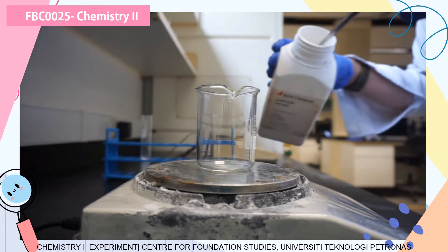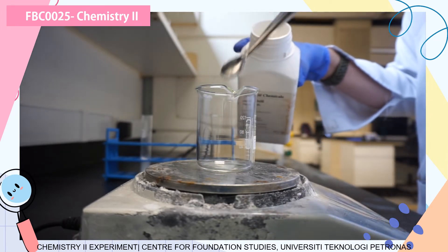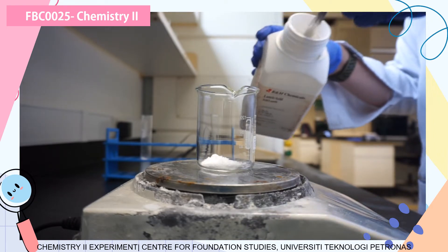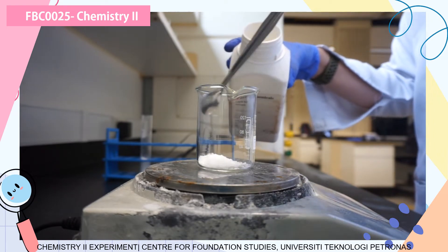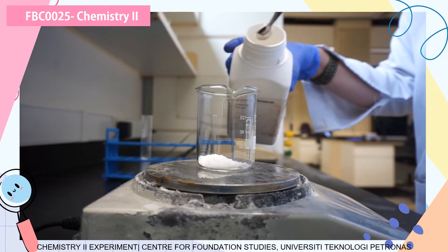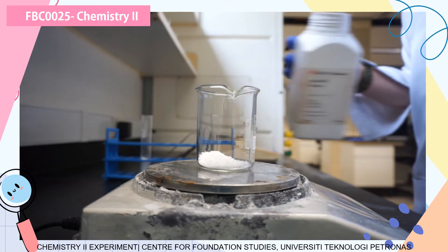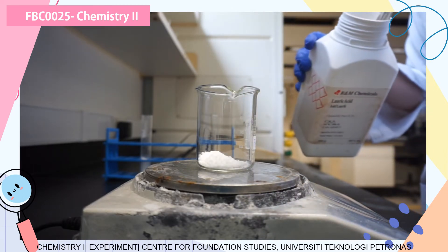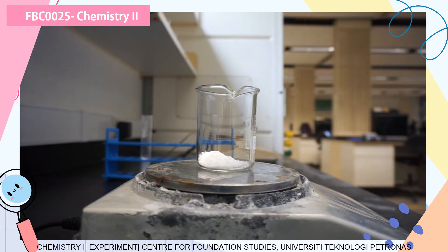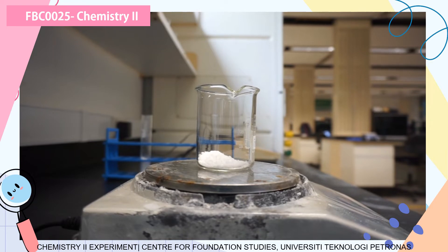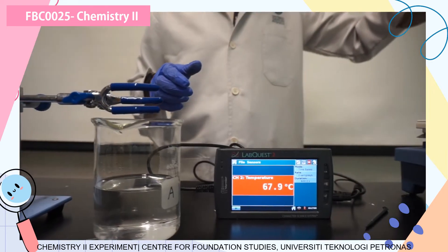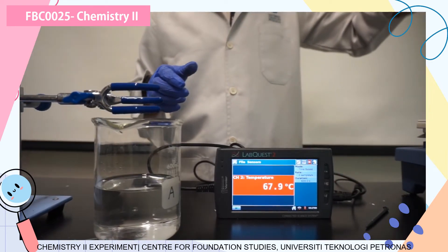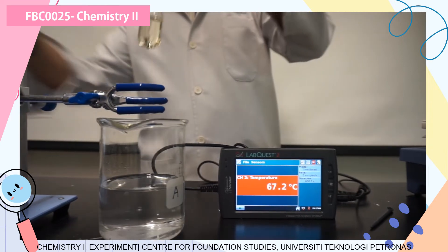Let me proceed with the steps on what you are going to do in the lab. You have lauric acid here. We are going to measure the freezing temperature of lauric acid. We are going to weigh it accordingly. You see that it is in powder form. You put it in the beaker. You can use a weighing balance as well.